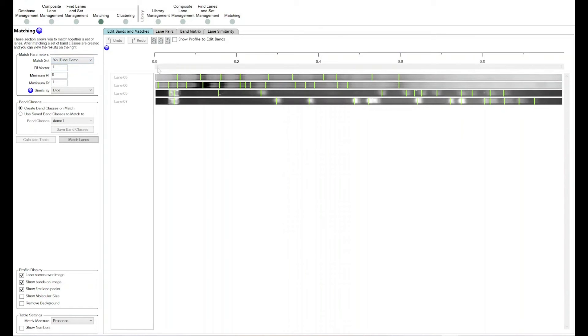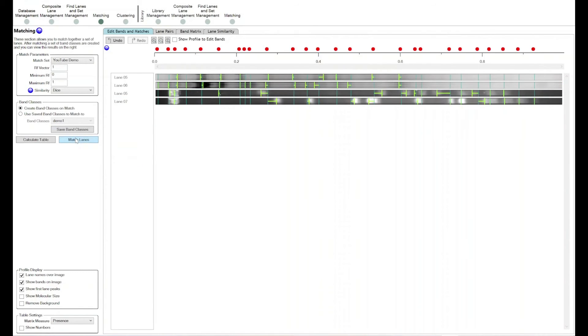So you select your subset, saying you want to compare all these lanes to each other and see where your matching bands are, where your differences are, and so on. Then you click on 'Match Lanes.'